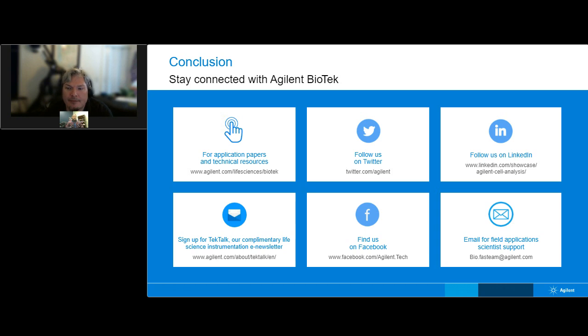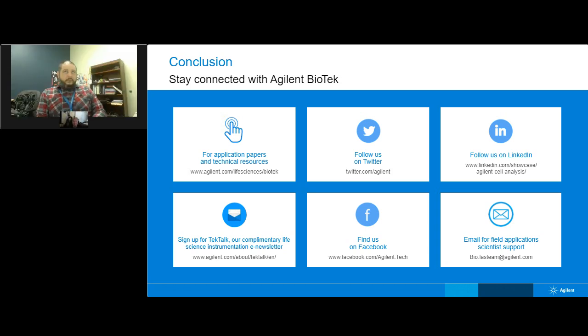Yeah. So there are different challenges when doing live imaging experiments. I guess the main concern with live imaging is phototoxicity. So one thing that you would have to consider is how bright is the fluorophore that you're trying to image, be it GFP or RFP or whatever have you.